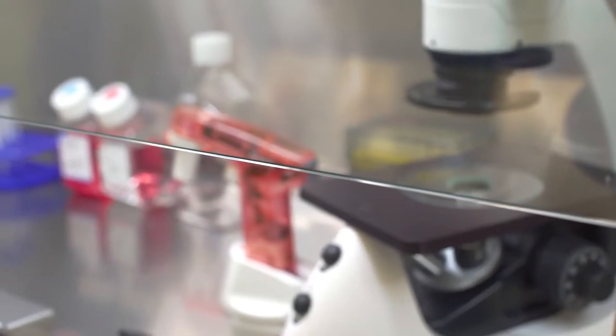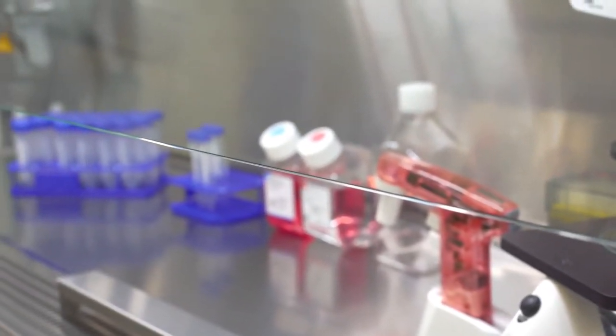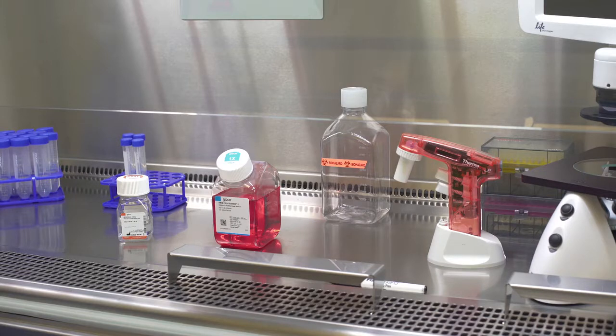For the same reason, it is important to keep the front sash in the lower position when working. The basic idea is to keep your media and reagents sterile by only touching them with sterile objects. Using sterile media, reagents, and supplies is a big step in keeping your cultures free from contamination.